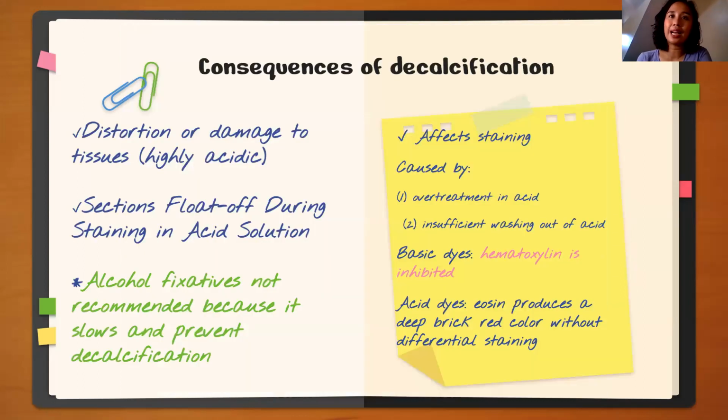However, guys, decalcification has impacts. Pero meron akong side note dito that when we decalcify, it is recommended that you do not use alcohol fixatives. Huwag gagamit ng alcohol fixatives kasi decalcification is a long process. Pag gumamit ka pa ng alcohol fixative, it could slow and prevent the decalcification process.